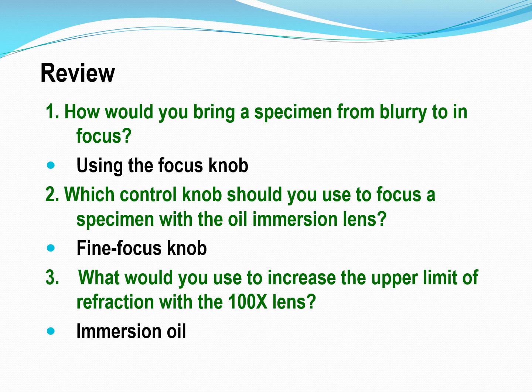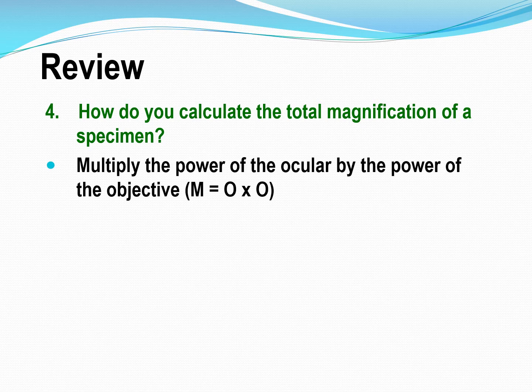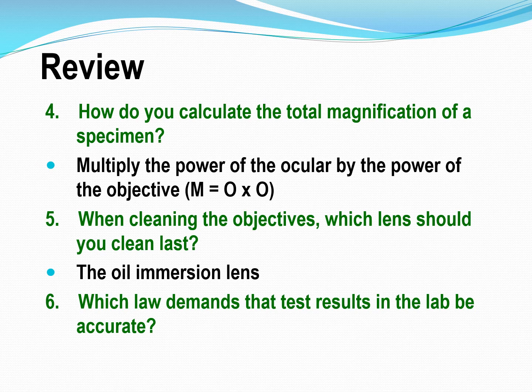So when I ask you in class, what focus knob do you use when you're using your oil immersion lens, you are going to know what to say, right? And when I talk about CLIA, you're going to understand.